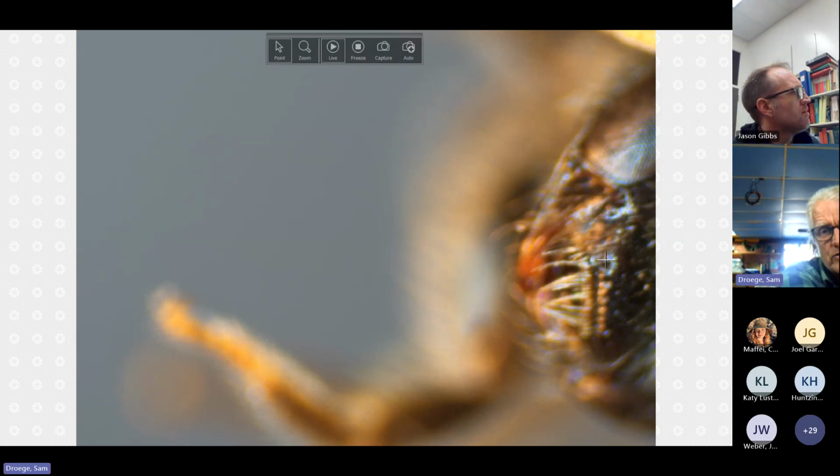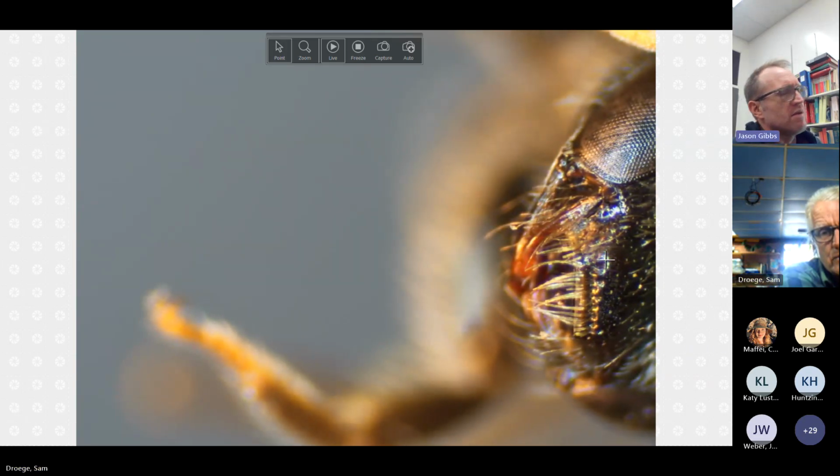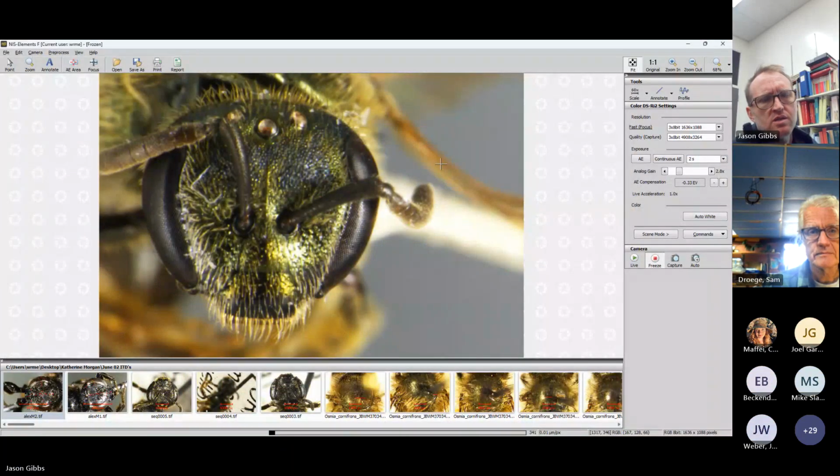That's why the trochanter is your friend. And the face shape as well for callidum. Yeah, I'm going to show a versatum face for completeness. So here you can sort of see that the clypeus is distinctly protruding down below the compound eyes, but it's a little wider. It's not quite as narrow as that admirandum style. It doesn't protrude as much.